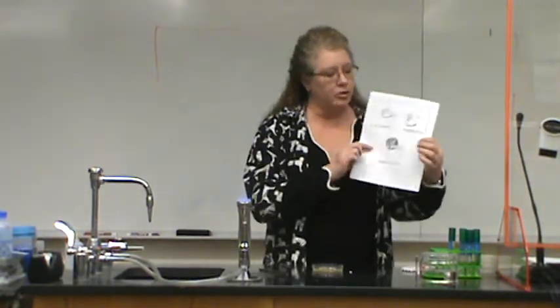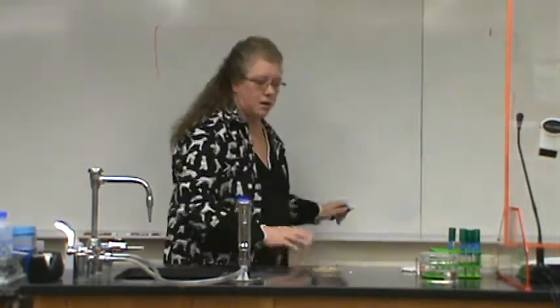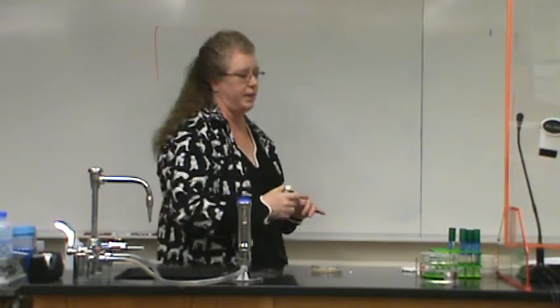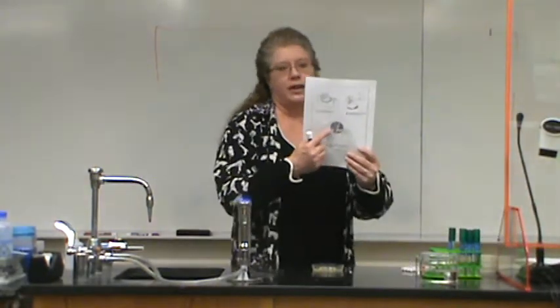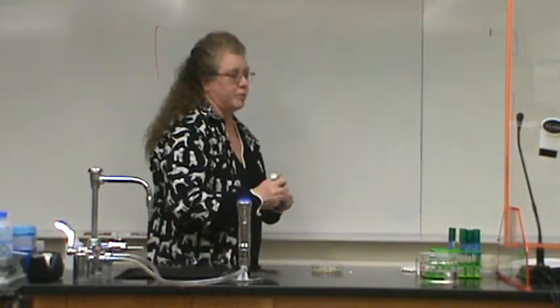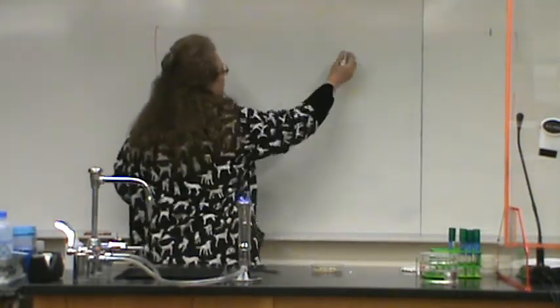They do show you what an example might look like. You'll see there's different zones of inhibition. And if the discs had been next to each other, you would not be able to determine the diameter of that zone of inhibition very easily. So when you put them on the surface of your agar, you're doing just 5 antibiotics. That example that they have has more than 5, but we're doing 5 because that's better. That's way too many.